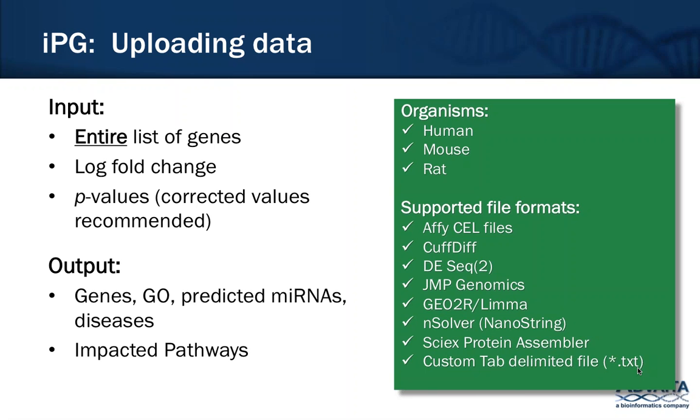And then we went commercial with this application just over a year ago. We have nearly 6,000 registered users now, which is, I think, a great testament to the usefulness of the application. We've been around for quite a while, and we have some nice partnerships out there. I think you'll be seeing more and more of us as time goes on.